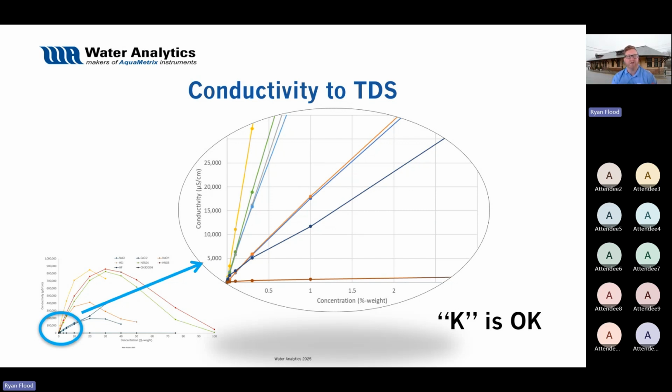And the best way to do that, right, is they take a sample at one point and take a measurement, and they realize the relationship between the conductivity value and the actual TDS is 0.61. Then you can plug that in. You have that moving forward, especially in stable conditions. It can work really effectively there. But again, coming back to it, K is okay in almost all applications, and most people don't really even know these technical pieces behind it.